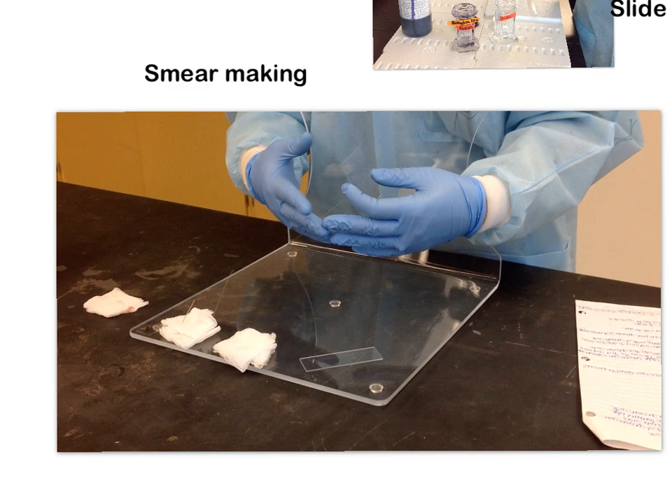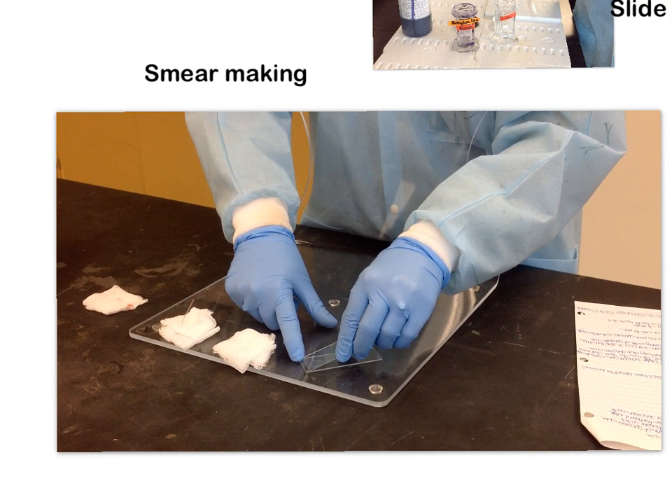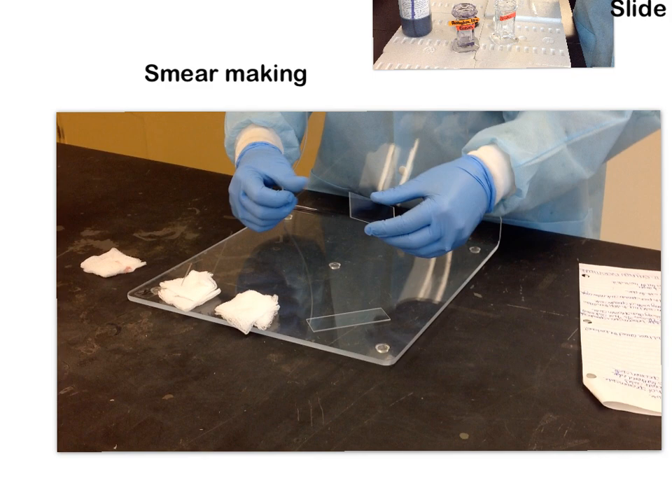The other variable related to pressure is speed. Again, what we're looking for is something even and consistent — you don't want to start really fast and then go really slowly. If you use too much speed, you're going to end up with a short, thick smear. If you go too slow, it's going to be a very long and thin smear, and you'll be in lab for the next six hours.